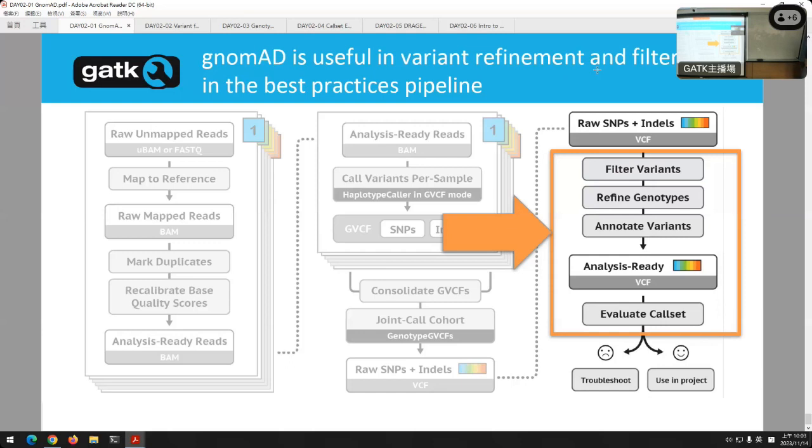Yes. You mentioned the gnomAD variants are joint called together. And I'm wondering, because we have different sequencing technologies, exome and genome sequencing, how do you join the coordinates together? What is the concern? Yes, thanks for asking that, because I think I wasn't totally clear. Actually, the exomes are joint called with all of the other exomes, and the genomes are joint called with all of the other genomes. But the exomes and genomes are not joint called together.